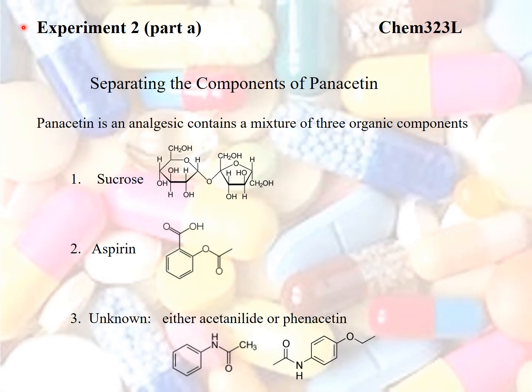This is the pre-lab discussion on experiment number 2, separating the components of panacetin. Panacetin is an analgesic, a painkiller, that contains a mixture of 3 organic compounds.